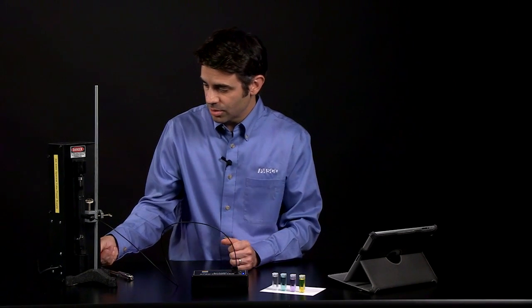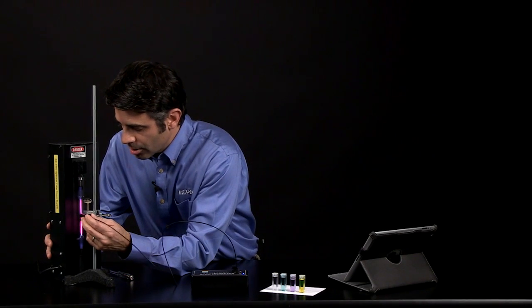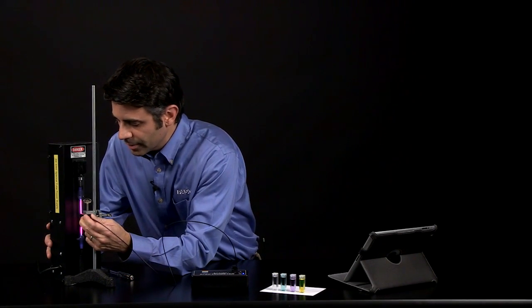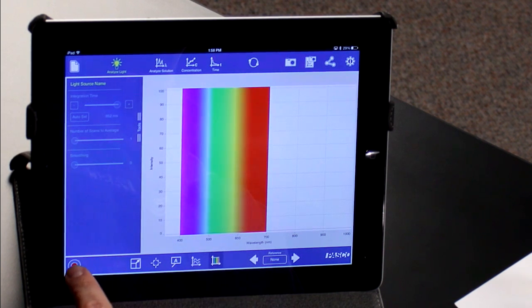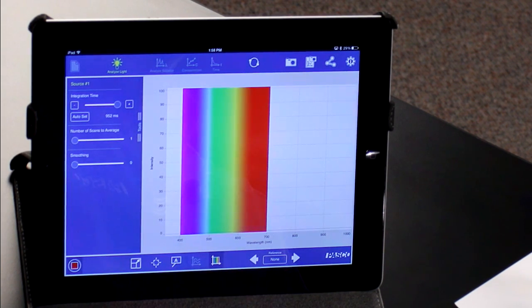I'm going to simply turn on my light source. Make sure everything is lined up nicely, and hit start. I'll start recording my data.